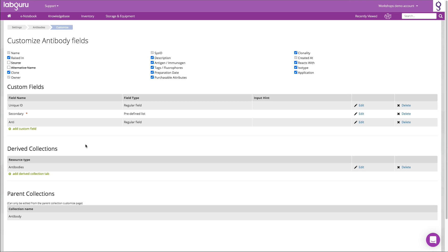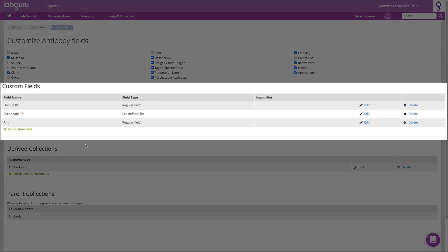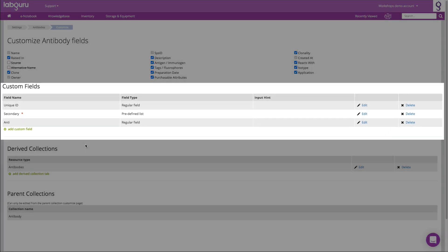Once you define the collections, you then want to customize the fields that you see for each. You can do that by using our default list or by creating your own custom fields.